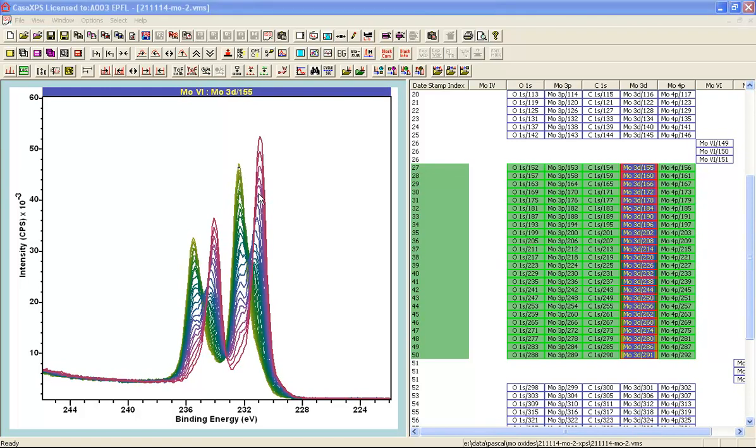So to summarize, the fact that these data were measured with dual charge compensation available, that is to say charge compensation through electrons of low energy returning to the sample and also connected to ground, meant that with time and an evolution in the material as a consequence of the measurement, the roles played by these two mechanisms has interfered with a stable peak position, and we've gone from a position that would be compatible with charge compensation through low energy electrons initially to a position that would be compatible with electrons returning to the sample through the ground, which is similar to what you'd see in the other two samples. So the importance of isolating a sample from ground when using charge neutralization can be illustrated through this observation.